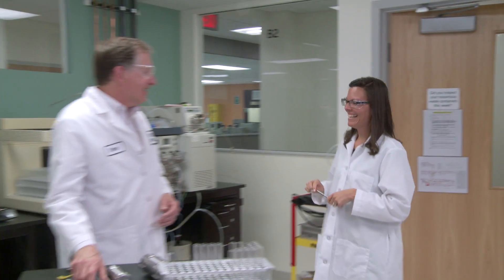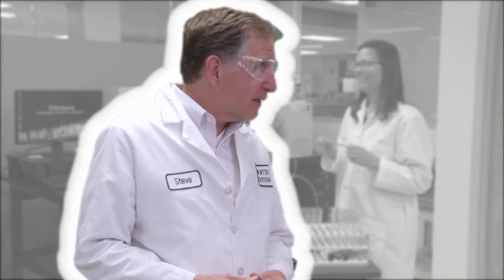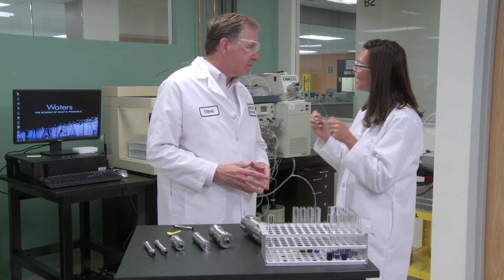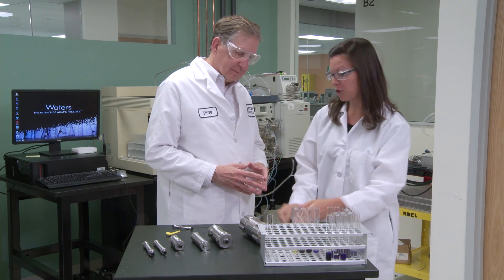Hi Steve. Hey Jen. I knew I'd find you in the purification lab. And that's perfect because I finally have my analytical method solid and I'm ready to scale up to prep.